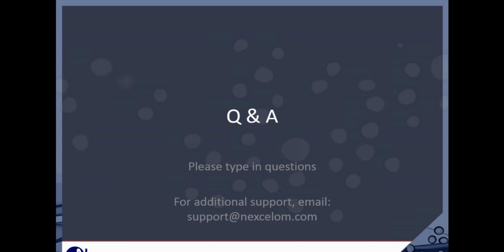As far as putting the samples, I'm not quite clear on the second part of the question about putting the sample set up. Can you maybe rephrase the second half, where you put the samples in and then image it? How long? Can you ask the question again?